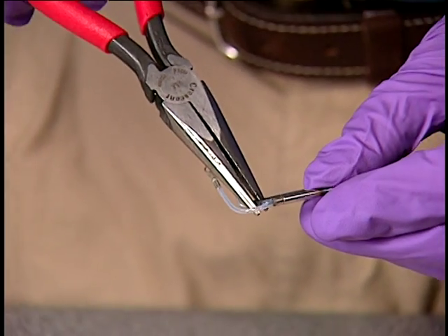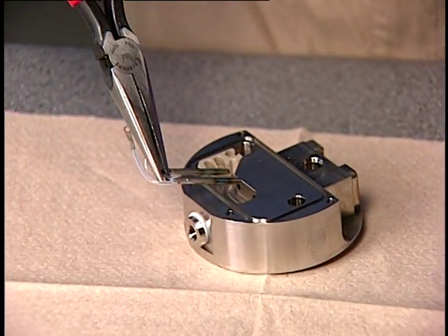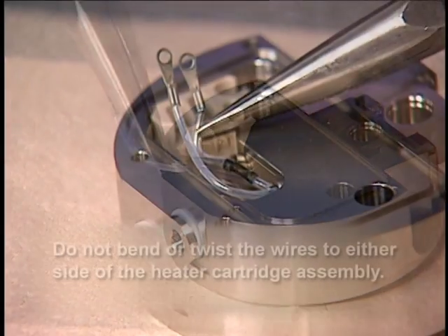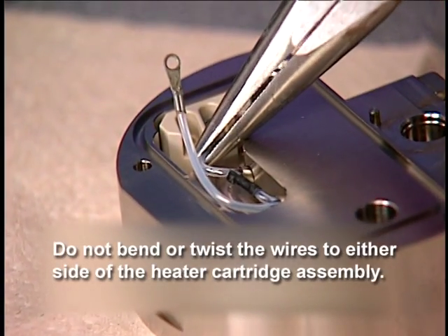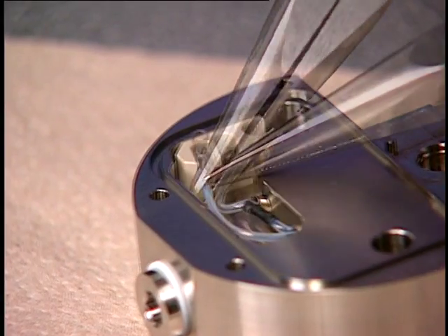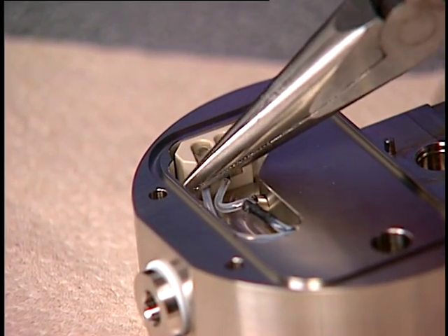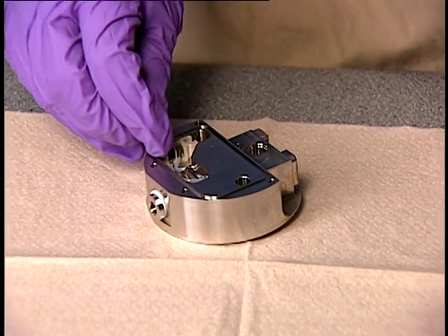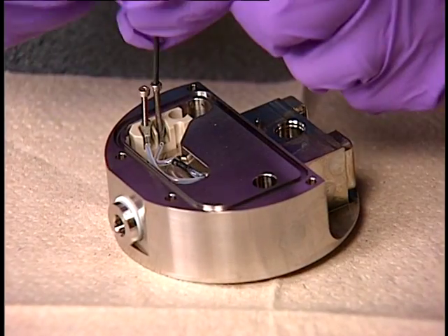Next, grasp the heat shrink tubing on the heater cartridge assembly and slide it into the ion block. The wires are fragile, so do not bend or twist them. To avoid a short circuit to the ion block cover, ensure that the ring tabs are pushed firmly down on the peak block terminals. Fasten the heater cartridge wires to the terminal block with the 1.5 mm Allen screws.